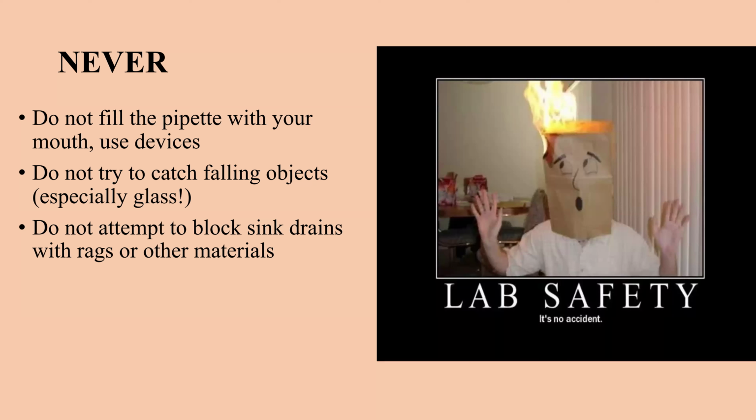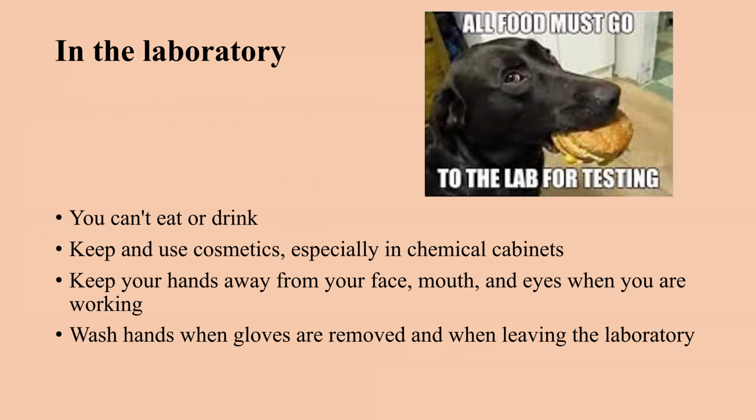Sometimes we should keep some water for cooling hot objects, and people block sink drains with different material for this. It's very easy to forget about this reserve fluid in the lab, and then an electricity problem after that.